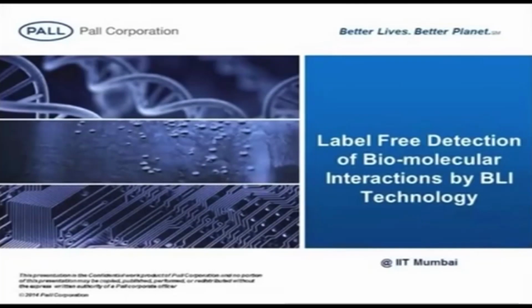As you know, there are detection systems, like in the case of protein estimations or kinetic studies, where you people perform ELISAs. In ELISA, it is an endpoint detection. You are attaching a kind of tag to that.